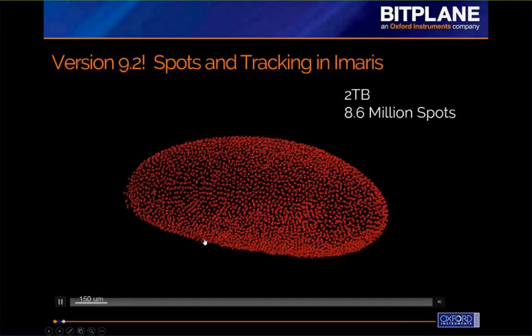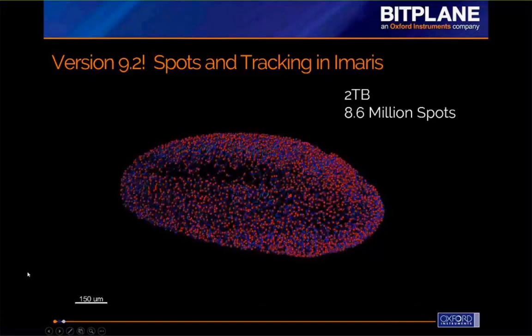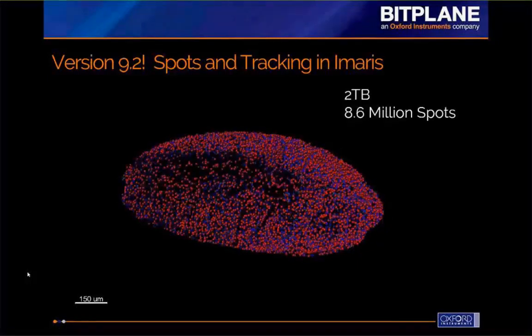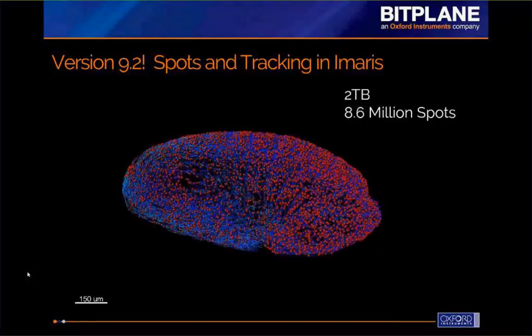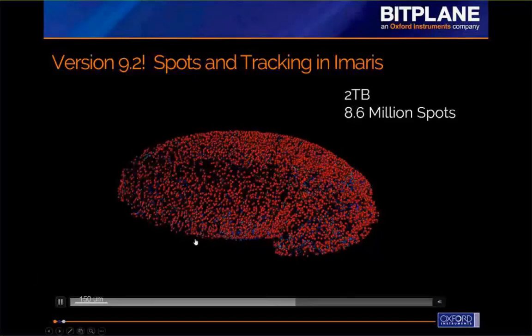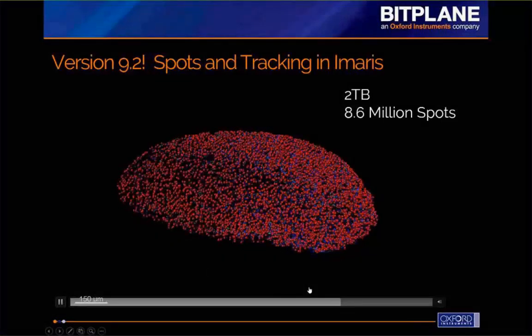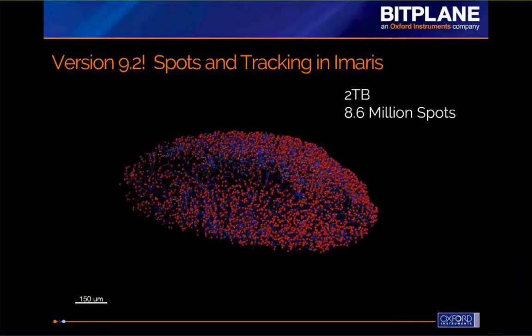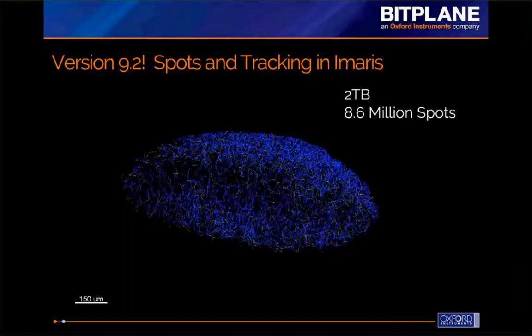Playing through this dataset, you can see the nuclei positions shown as red spots with color-coded tracks. If you know Drosophila development, you can see germ band retraction happening, as well as developmental segmentation. The embryo progresses to where its muscles start working and it begins to twitch — really cool to observe. This entire dataset can now be analyzed in a relatively short period of time, and you don't have to settle for working on just a region of interest or a portion of the dataset.